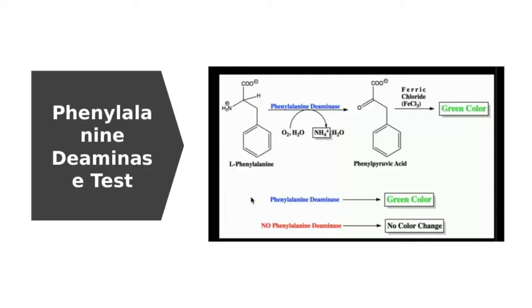And that's an important step, especially when you're trying to define what the pathogen might be. Okay? Very good. Let's go on to the second test. Second test is easy. It's called the Phenylalanine Deaminase Test. And what we're looking for here is the ability of a microorganism to deaminate. And when you deaminate, the enzymes will remove the amino group, right? So the amino group gets removed and it immediately is not happy. So it picks up another hydrogen and it forms ammonia.